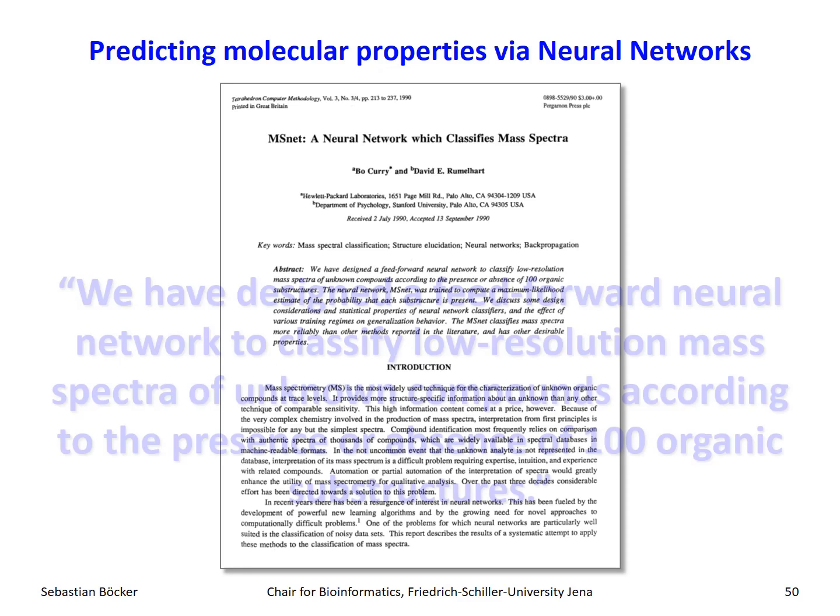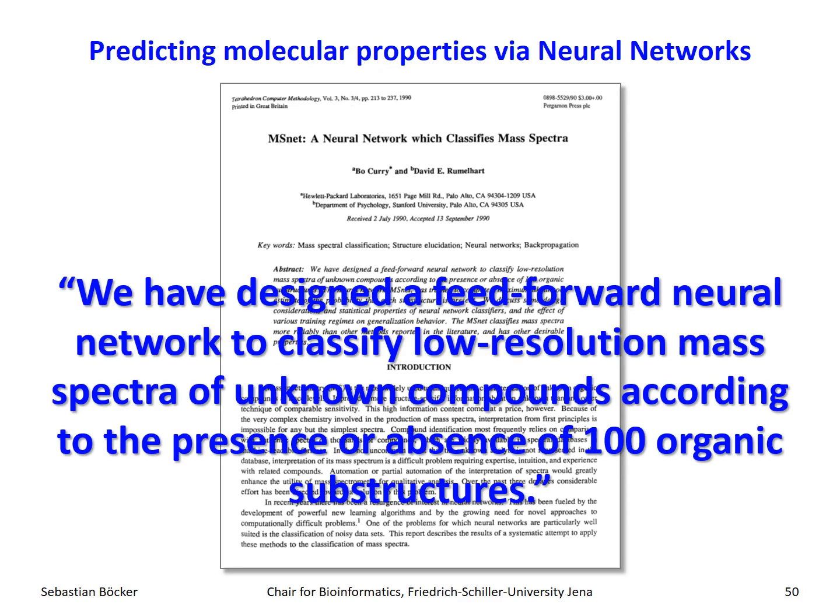And in this 1990 publication, they actually did that. They used neural networks to predict these fingerprints, molecular fingerprints. But that didn't work so well, because you now have to, for example, encode the features that you find in such a mass spectrum in a way such that a neural network can work with that. And the support vector machines of FingerID did the job much better than this neural network. Okay? So it's not that easy. You can't simply replace the machine learning method, the model, and expect that everything works better. It might even look like it's working better in your evaluation, but you really then have to check if it's also working better for independent data, for novel compounds, which the system has never seen and which are totally different from anything it has seen so far.